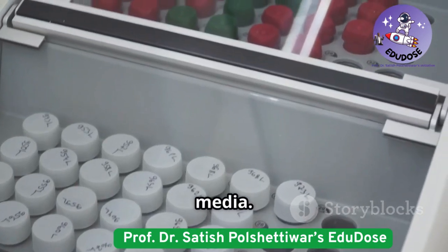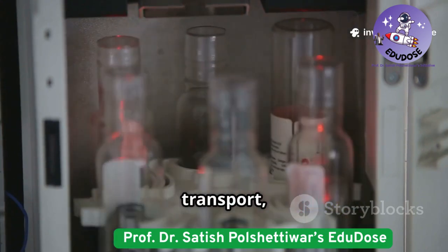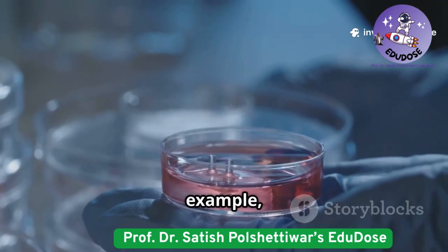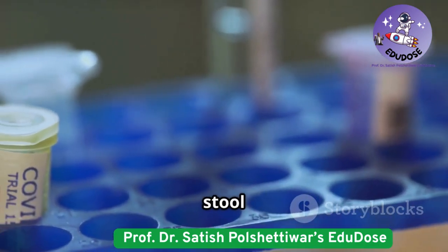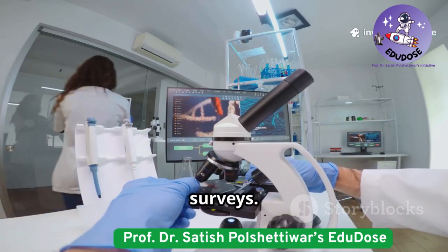Don't forget transport media. These special media help preserve specimens during transport, preventing overgrowth or drying out. Stuart's medium, for example, is used for Neisseria species, and Cary-Blair medium is great for stool samples. Super important for clinical diagnostics and field surveys.